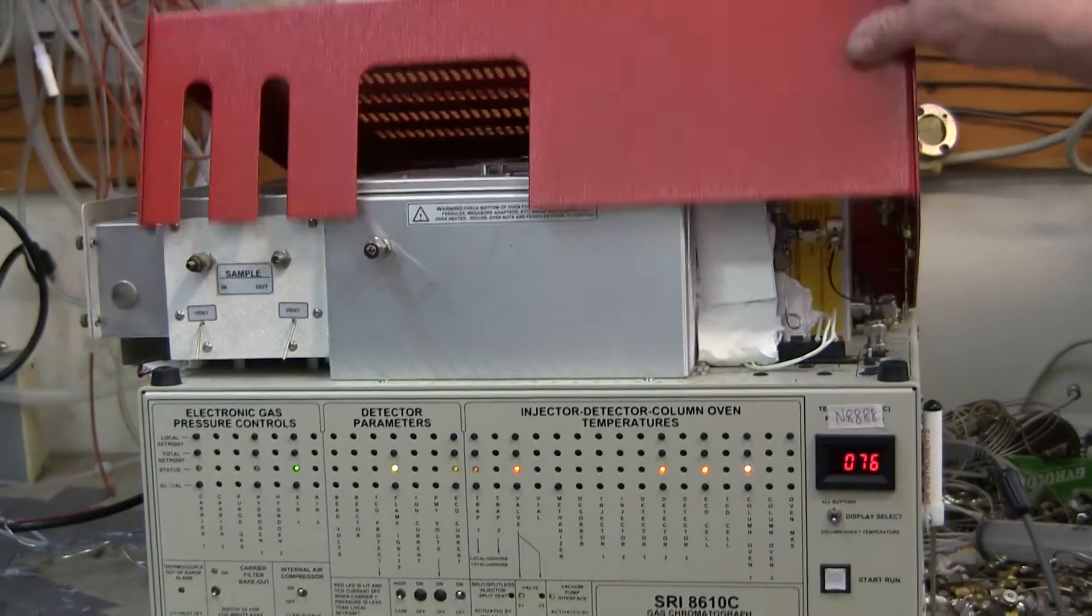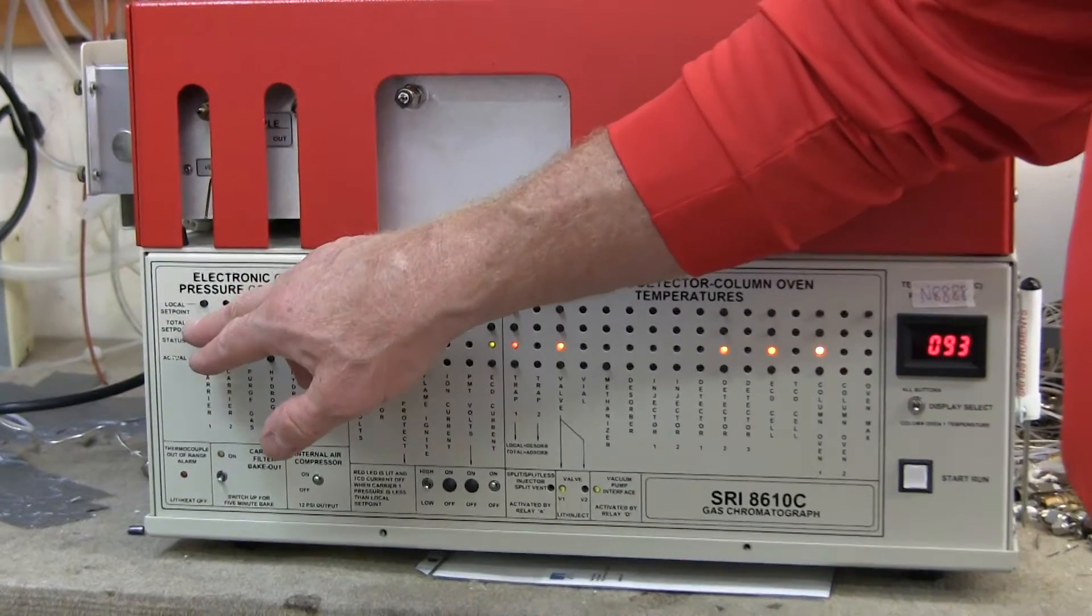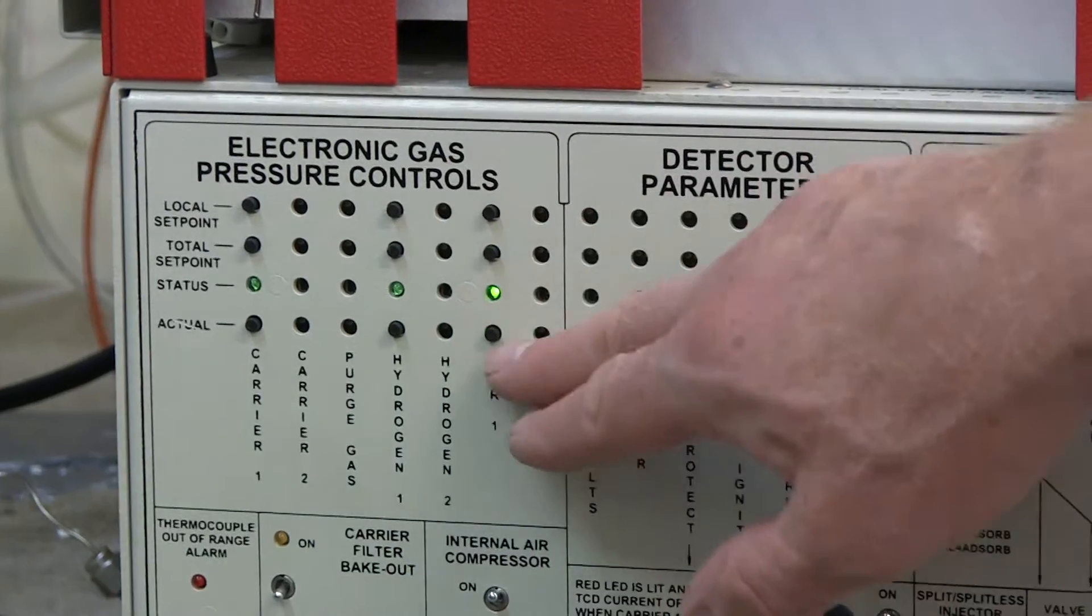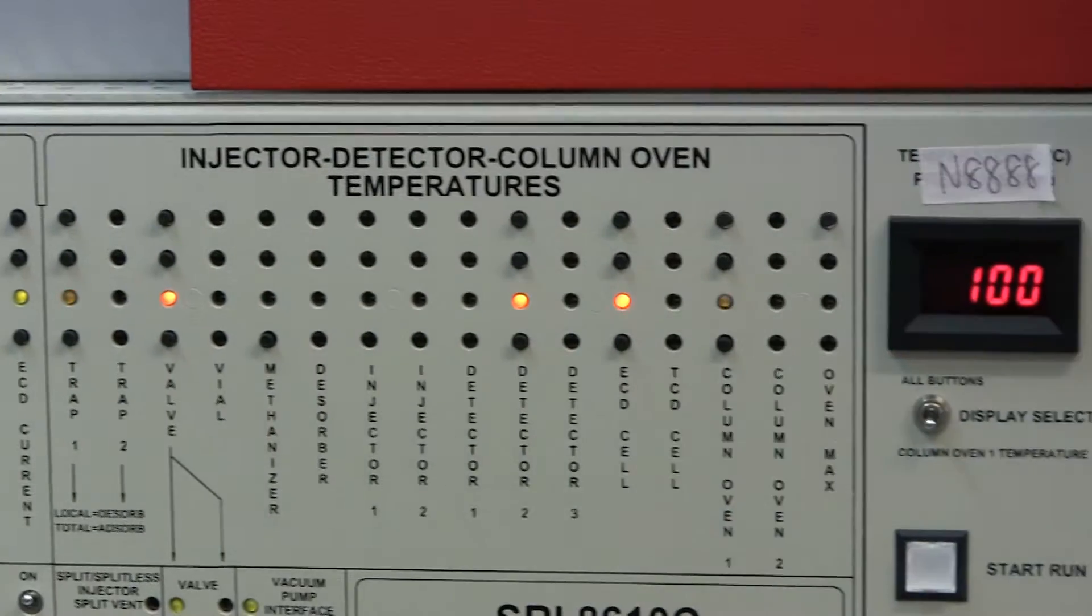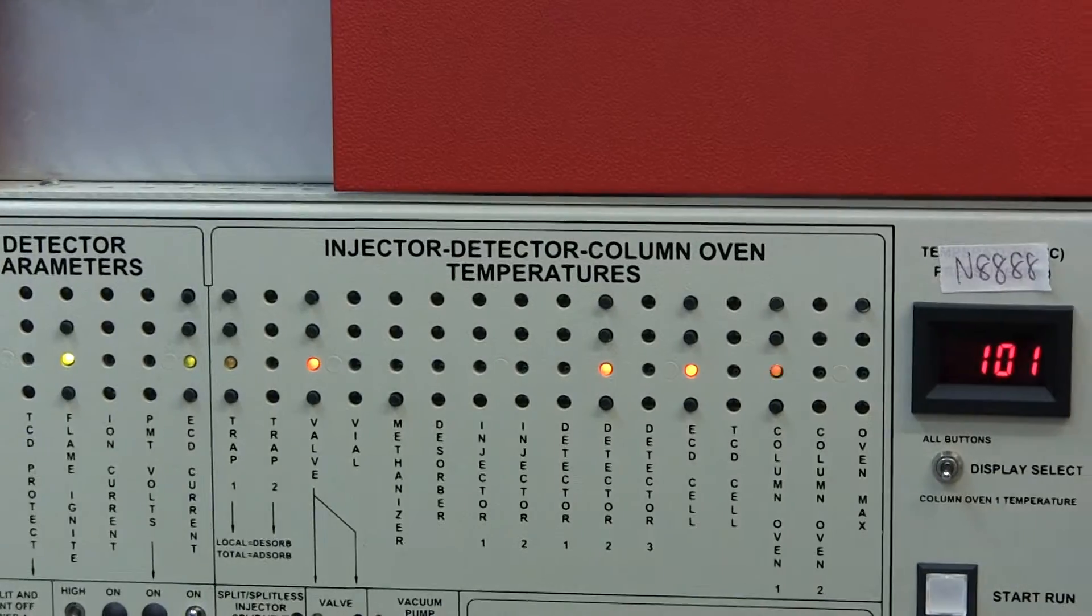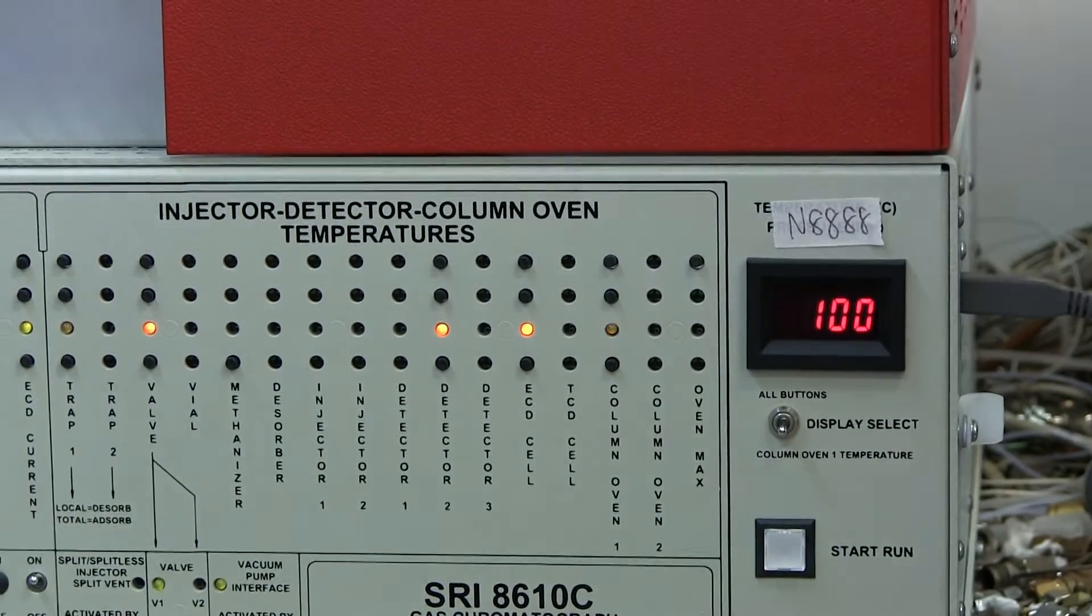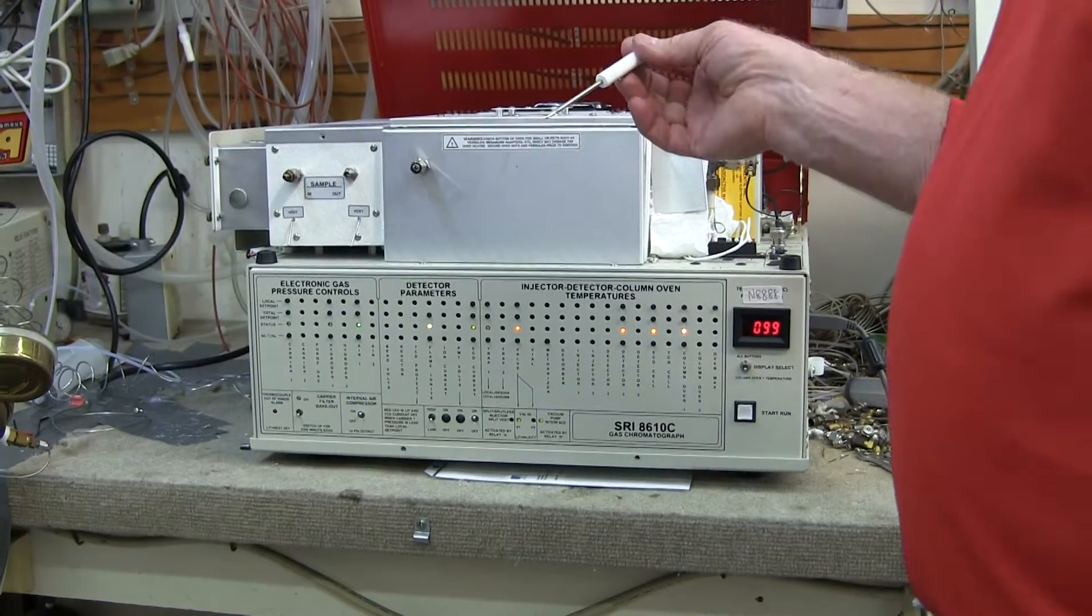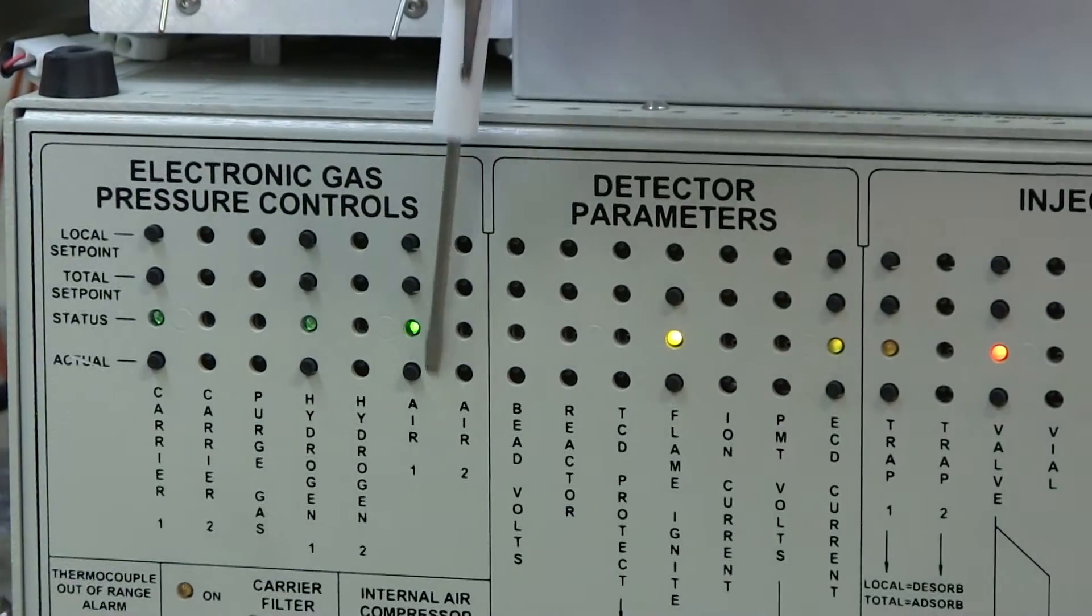The way the SRI system works is that all the controls for the GC are these little buttons on the front panel. Sometimes there's only two but most of the time they're adjusted with the screwdriver which comes with the SRI GC and mounts here in a little holster on the right-hand side. For instance, if you wanted to change the pressure of one of the gases, this particular GC has a carrier gas, hydrogen gas, and air.